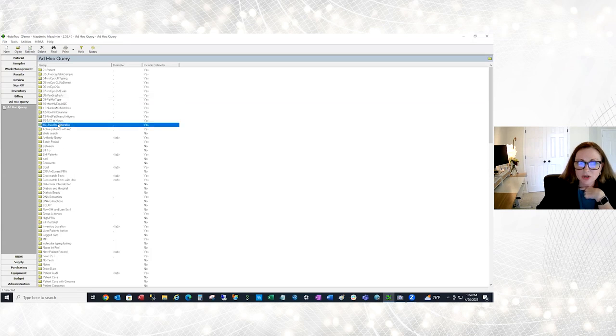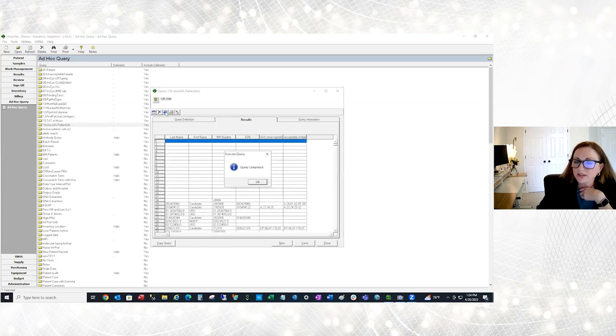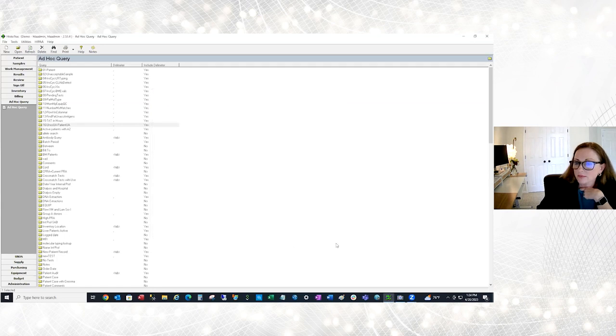A last example that I'll show you is that we could present this from a patient level. You could look at the UNOS unacceptables and then what we call the patient's cumulative or historic unacceptables. You could run this report to see maybe where you have potential discrepancies, if you needed to tidy up your data, or maybe you needed to go research and find out why.